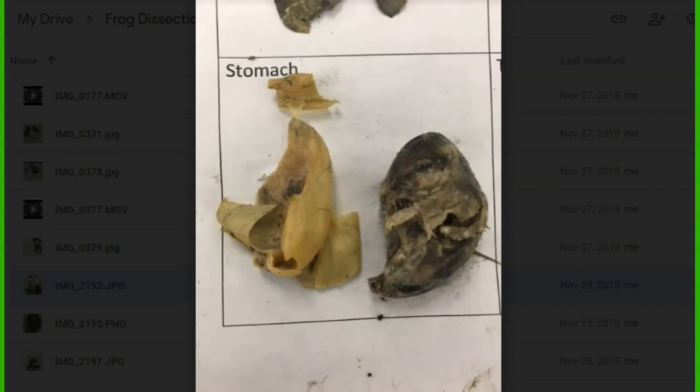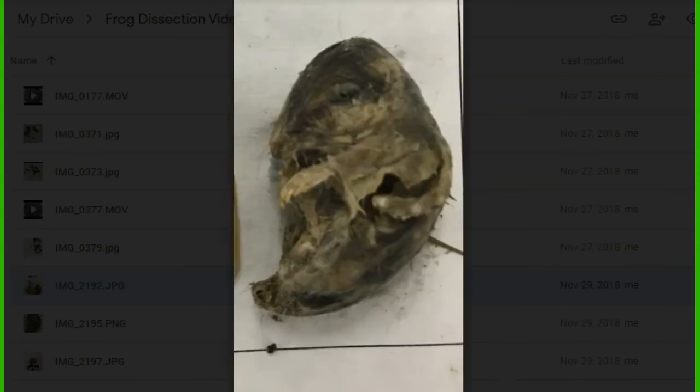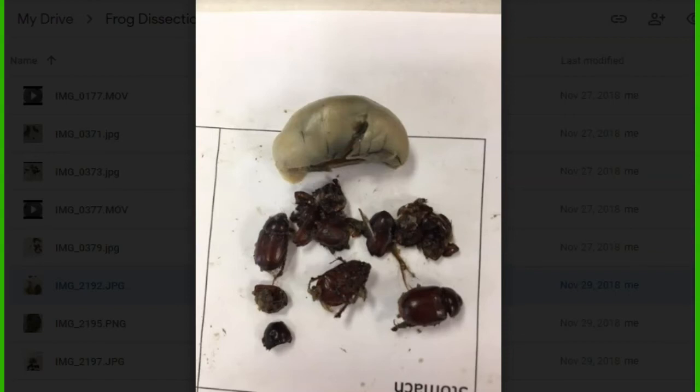And here is a one-of-a-kind also. I've never found this. The stomach was about to rip open. That is a mouse, and there it is, all curled up. This frog ate a mouse. These frogs are not bullfrogs. They're leopard frogs. To be able to swallow that, it's pretty amazing. See the head and the little claw. And another distended stomach full of June bugs. Had quite a few. I think there was about 8 in there.